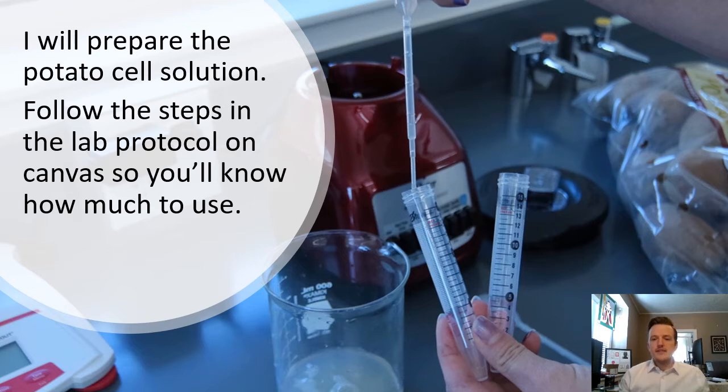So the potato cell solution will be prepared in advance, and so you don't necessarily need to worry about how it's prepared. You just need to know that this potato cell solution has the actual enzymes that were living in a potato. So this is an actual live enzyme experiment. These aren't manufactured or anything. This is just extracted from the potatoes, and the instructions for the lab protocol and the walkthrough and everything should be on Canvas.